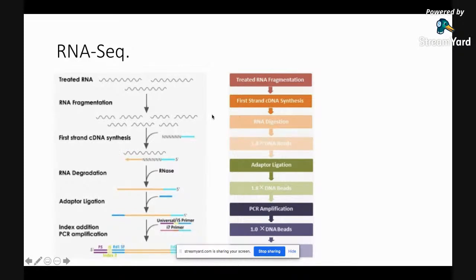Two of the most important things are the amount of RNA that you sample, because when you're ligating an adapter, maybe in some cases you get a lot of molecules, and in some cases you capture fewer molecules. So from sample to sample, you will have some differences, right?